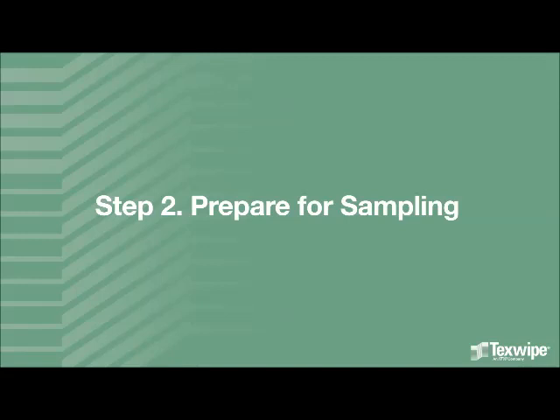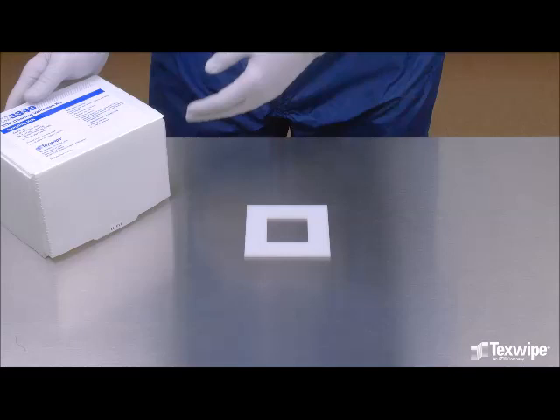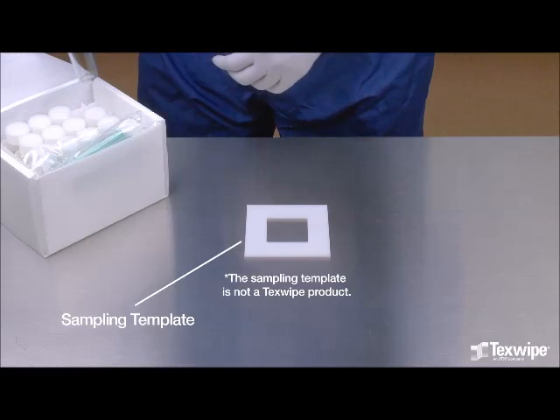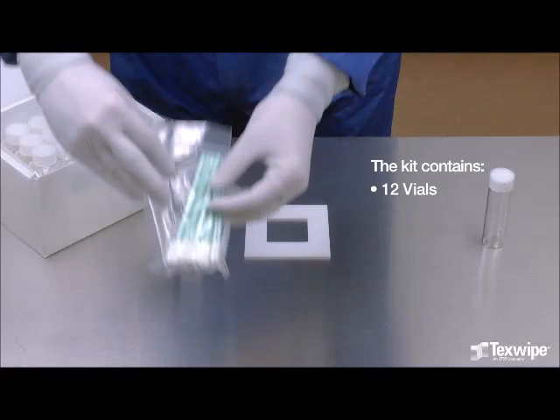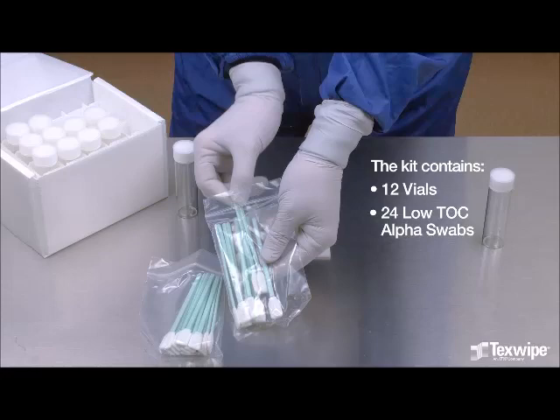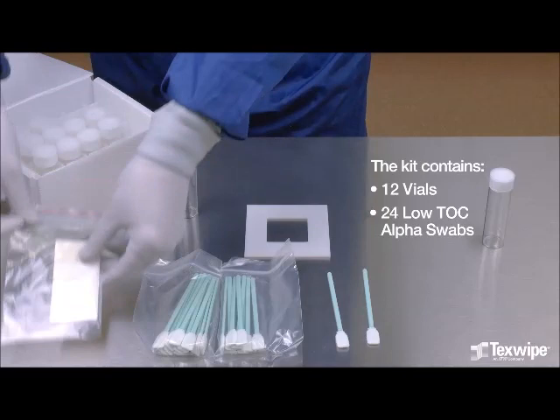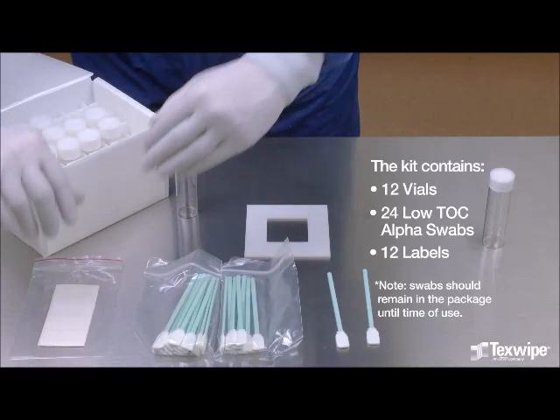Step 2: Prepare for Sampling. The TX3340 TOC Cleaning Validation Kit will be used for demonstration. Each box is individually lot coated. A sampling template is used to define the sampling area. Please note, the template is not a part of the kit. The kit contains 12 vials. The first vial will be used for the low TOC water to wet the sampling swabs. The second vial will be used to place the swabs in after sampling. The kit also contains 24 low TOC alpha swabs with a notch for easy breaking after sampling. Two swabs are used for one sampling procedure. Note, the swabs should remain in the package until time of use. There is a cleanroom compatible label for each vial in the kit.